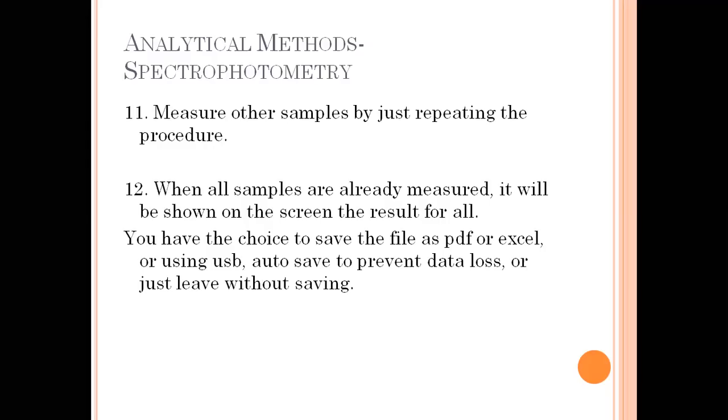Measure other samples by just repeating the procedure. When all samples are already measured, it will be shown on the screen. Okay? The result for all. So if 10 groups have read, it is all there on our screen; it doesn't get erased, it stays there.